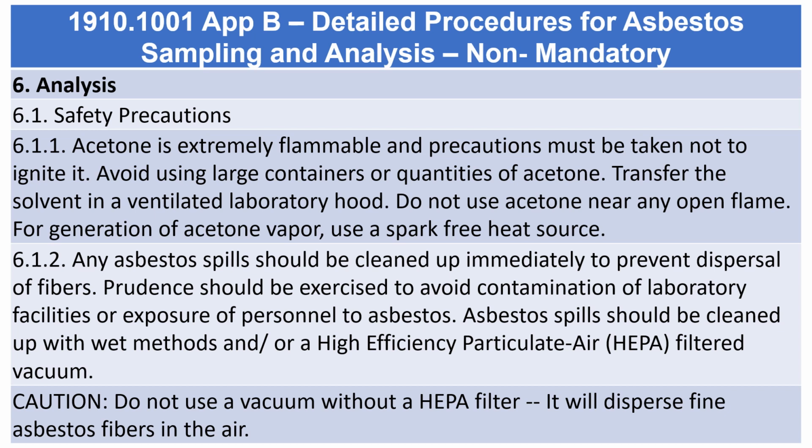6.1.2. Any asbestos spills should be cleaned up immediately to prevent dispersal of fibers. Prudence should be exercised to avoid contamination of laboratory facilities or exposure of personnel to asbestos. Asbestos spills should be cleaned up with wet methods and/or a high-efficiency particulate air (HEPA) filtered vacuum. Caution: do not use a vacuum without a HEPA filter, it will disperse fine asbestos fibers in the air.